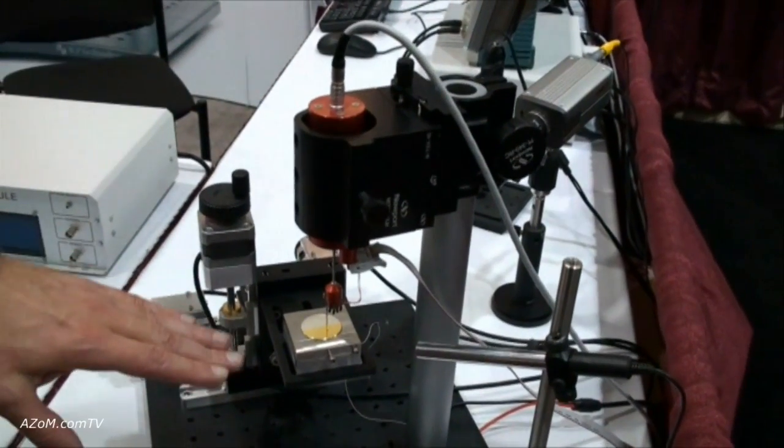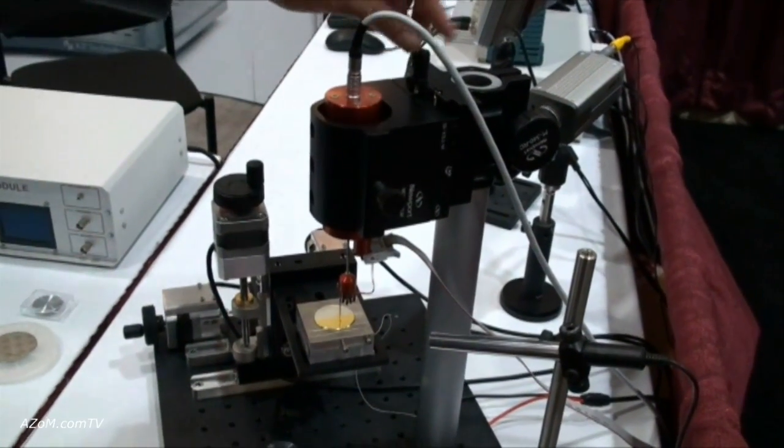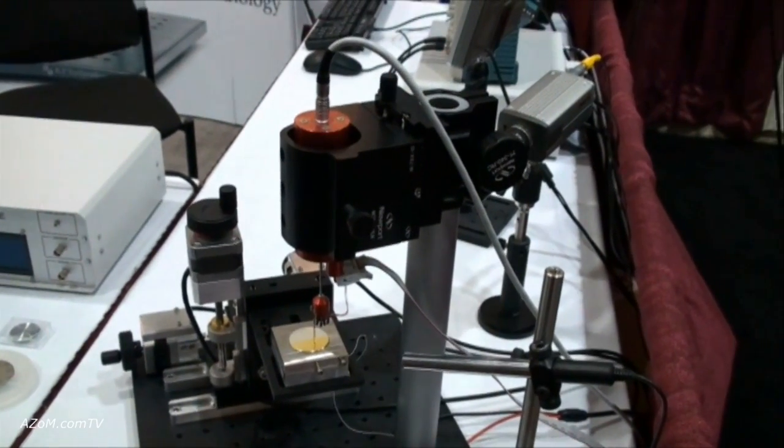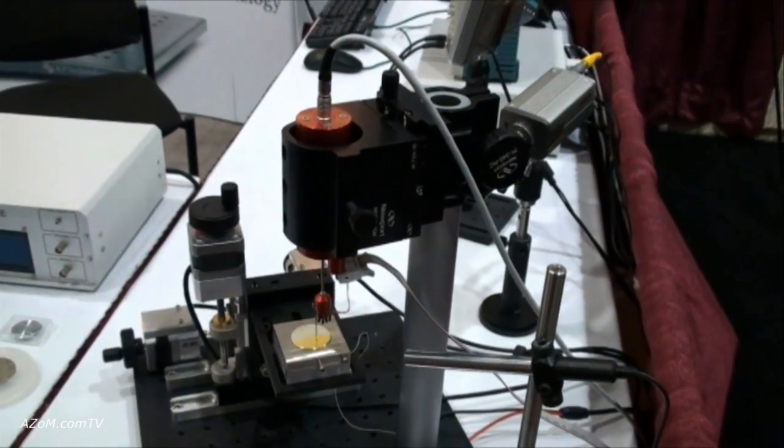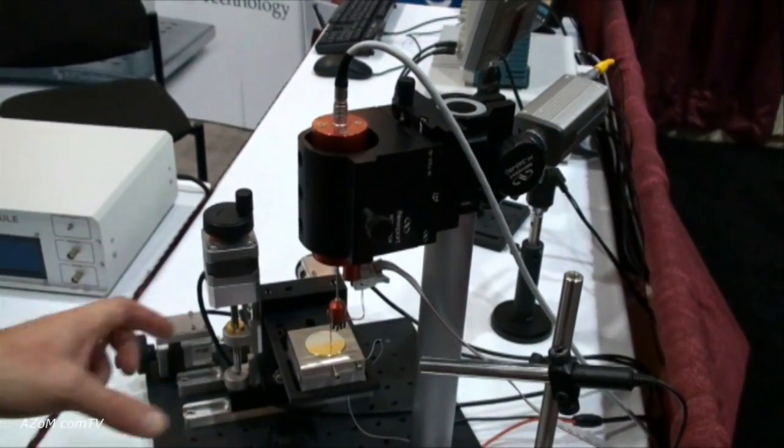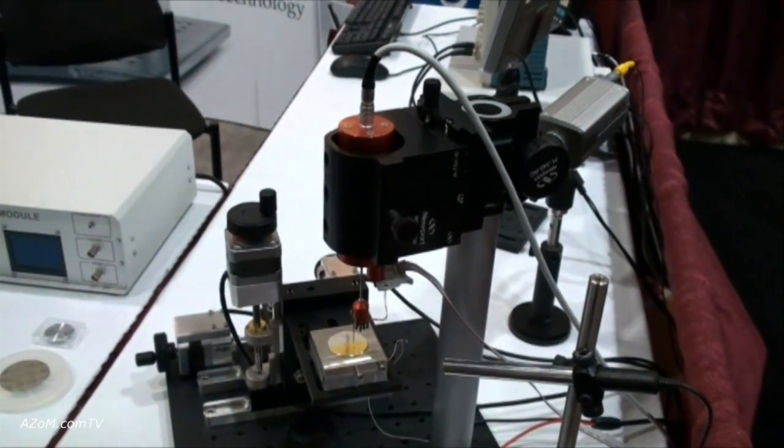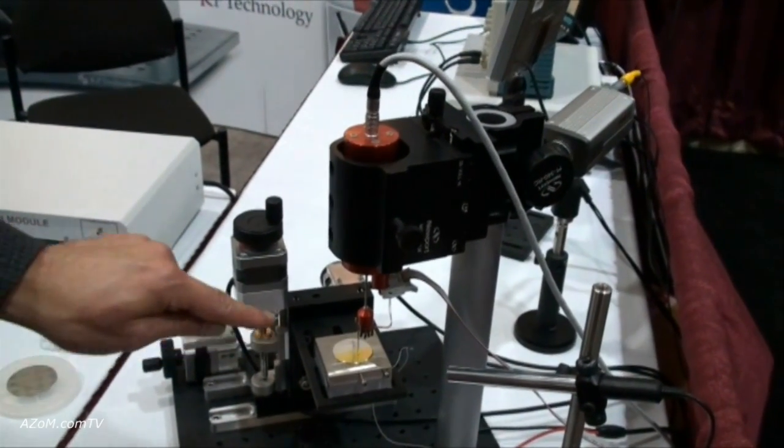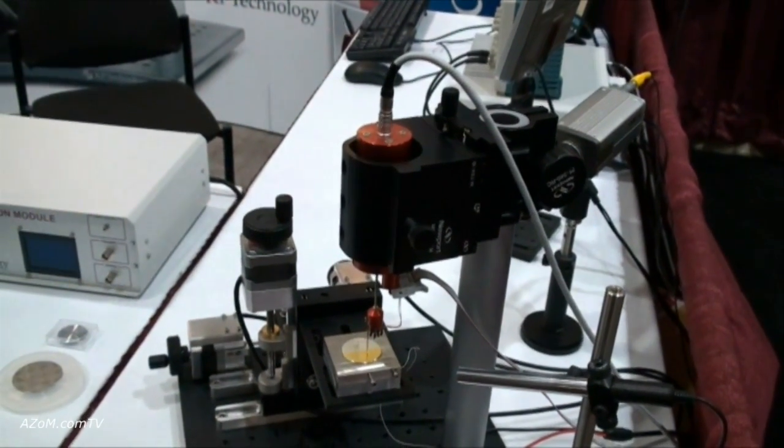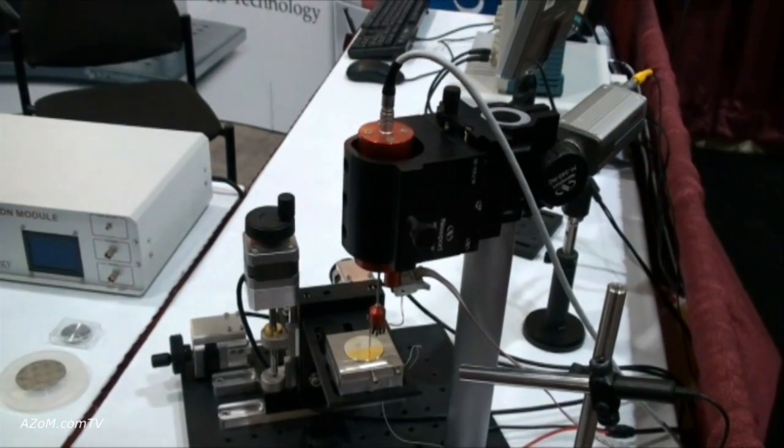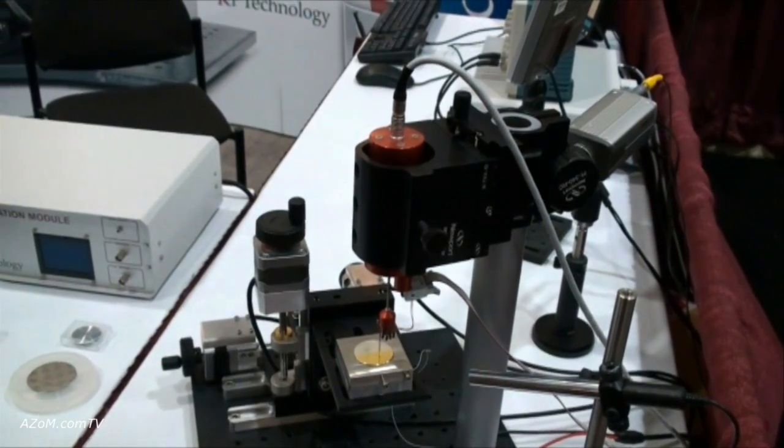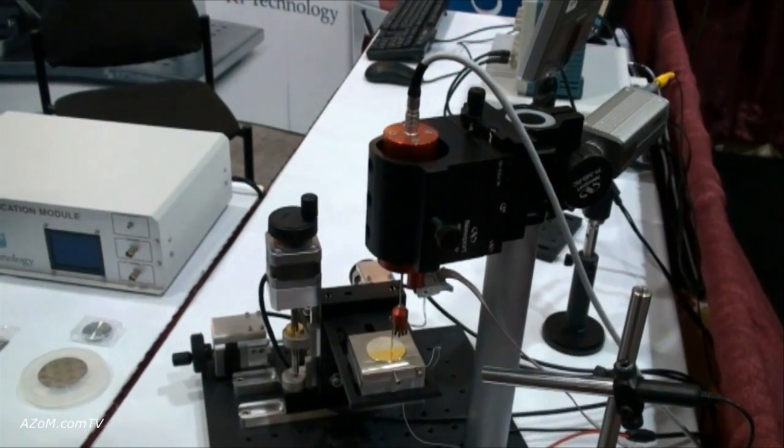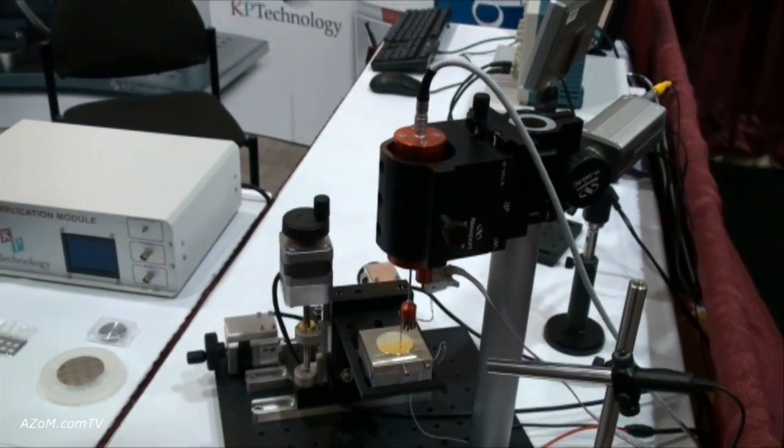Here we have a scanning platform with a tip that I can move up and down. The tip is vibrating and produces a signal at the oscillation frequency of about 70 or 80 hertz. The sample moves under the tip, and we form a three-dimensional map of the work function or surface potential. Because we have an interface here, we'll see that as a big work function contrast. It's an ideal technique because it gives you real millivolt resolution, whereas other techniques give you contrast but you don't actually know the scale.